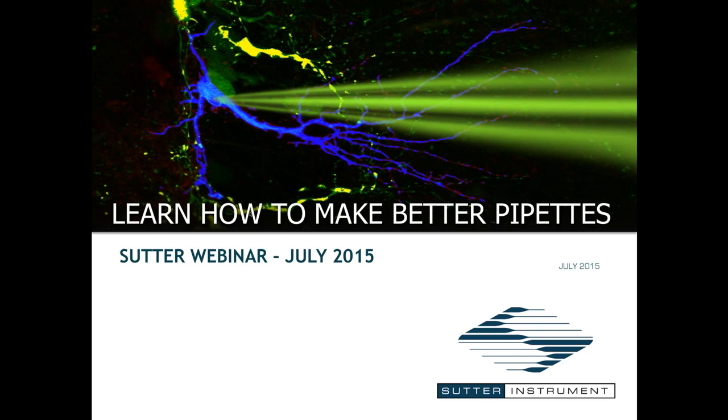And then if I'm a little worried about some new person in the lab who might be running into the filament or isn't sure what they're doing and I have a little paranoia, I might run that ramp test a little bit more often. If I see that the filament looks kind of funky and someone's had a collision with it, with the glass, I will also run a ramp test to see if the heating characteristics have shifted as a result.